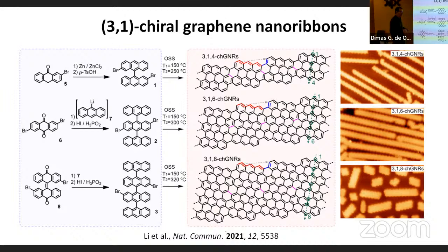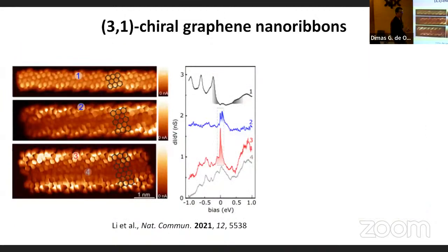Okay. So now you can take these different ribbons and characterize them, as I said before, and measure their properties. You can actually resolve their chemical bonding structure. If you take your scanning probe microscope and functionalize it with a CO molecule, and approach very close, then you can resolve the chemical bonding structure. You can see the hexagons more or less nicely for these differently wide ribbons.